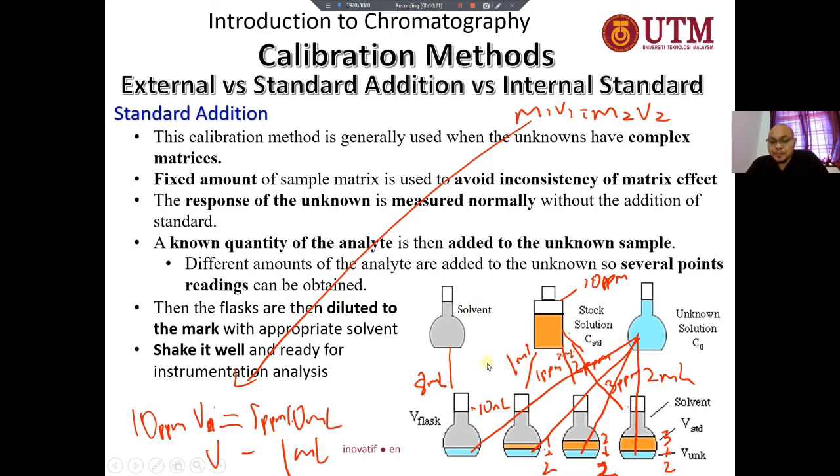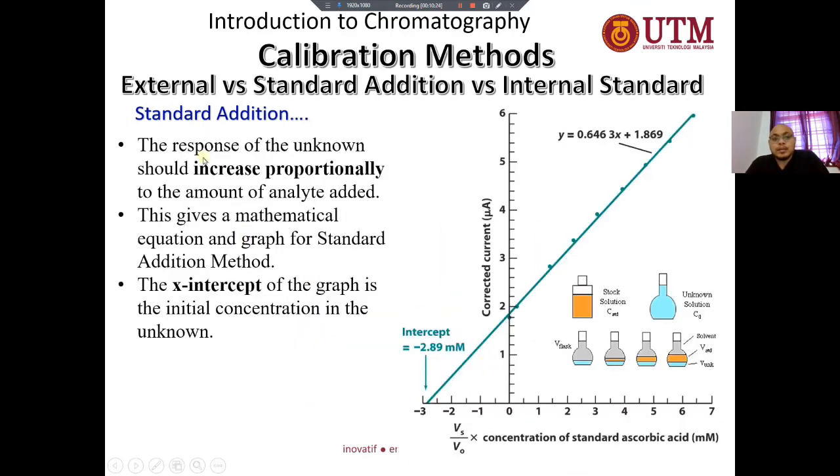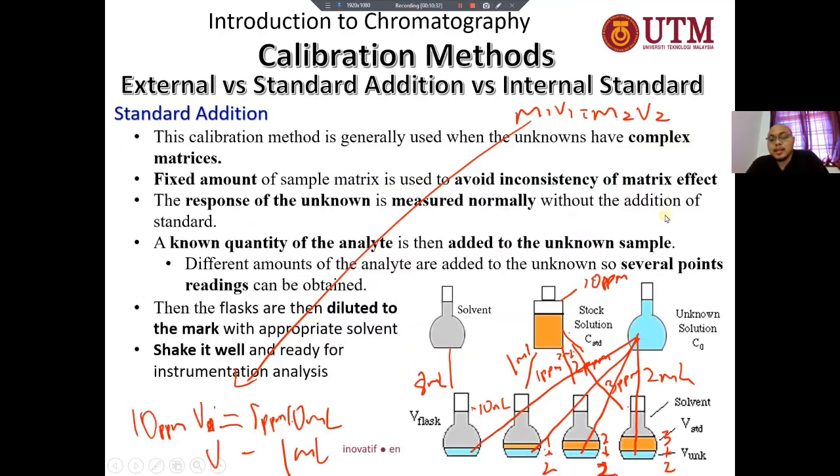Here is the common way. The response of the unknown should increase proportionally to the amount of the analyte added. So it should be increased proportionally. Again, here I want to mention, I want to stress it out.